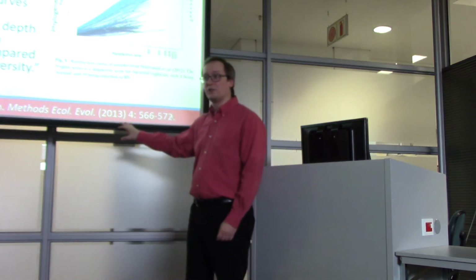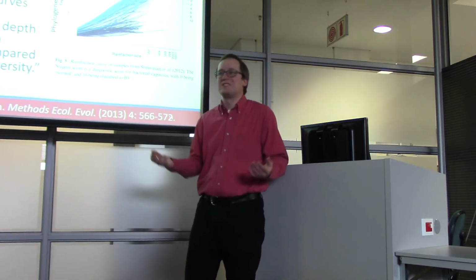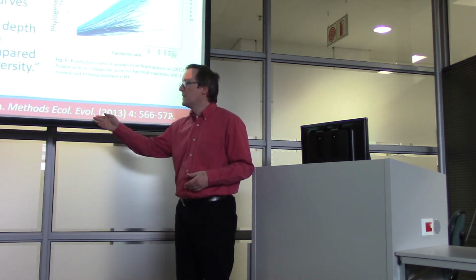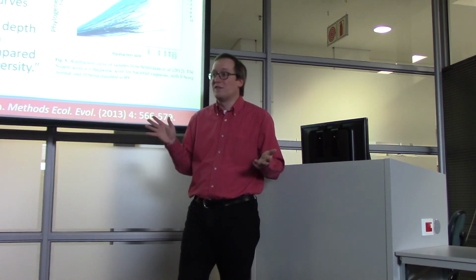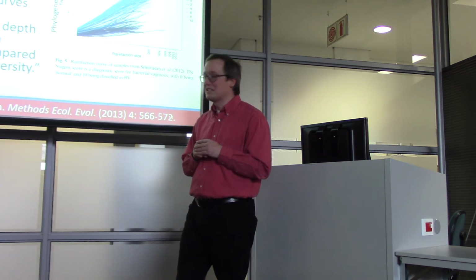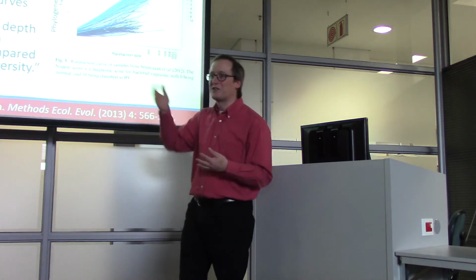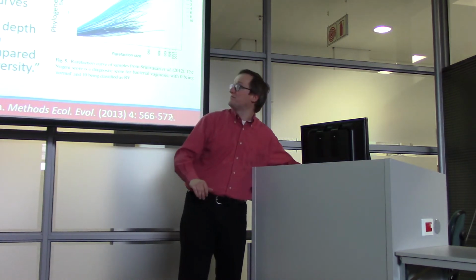Very challenging articles in this space suggest that we're never going to be done sequencing everything that's out there. I think that's already pretty clear. But as you read other papers in the rarefaction curve space, one of the things you conclude is that statistically it's kind of problematic. You always want to use all the data that you have, and rarefaction, of course, cuts into the data we have available to us.